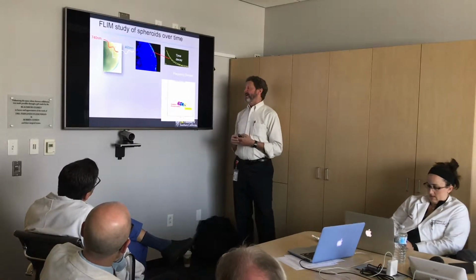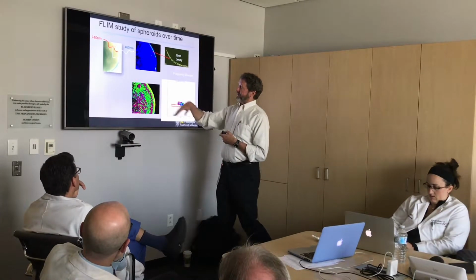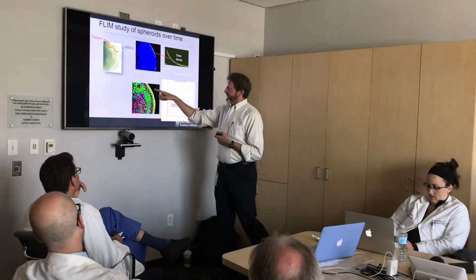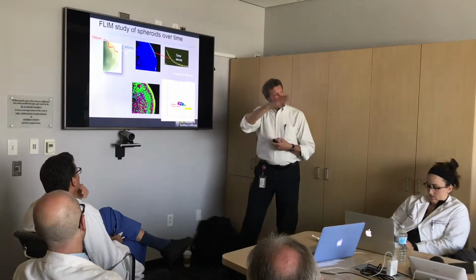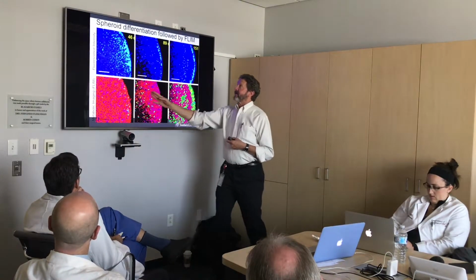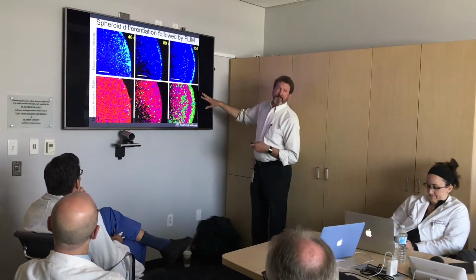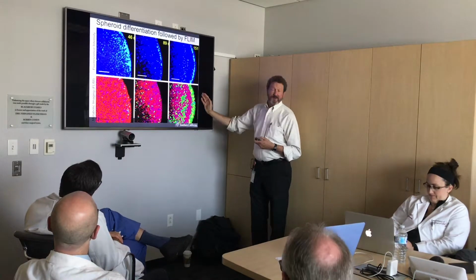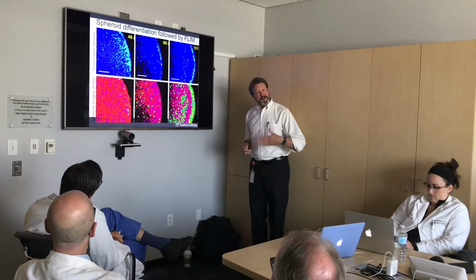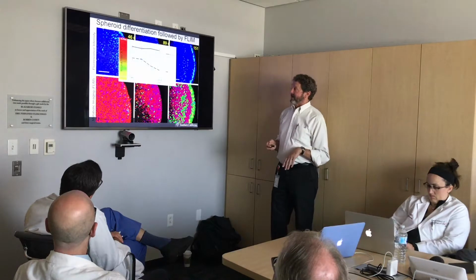We're just trying to get in place to where we can do it in human subjects. But if we look at one of these retinal spheroids, we can see where the photoreceptors are very glycolytic. We can see the other metabolism on a layer by layer basis. And we can watch then as the spheroid develops from just a month or two old to half a year old, and watch as it laminates out. So this is something that lends itself to ongoing evaluation of tissue metabolism and tissue state.